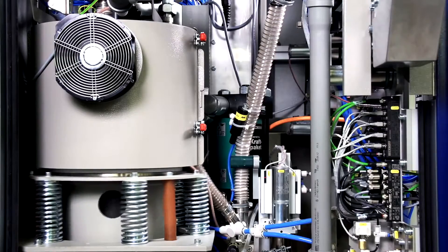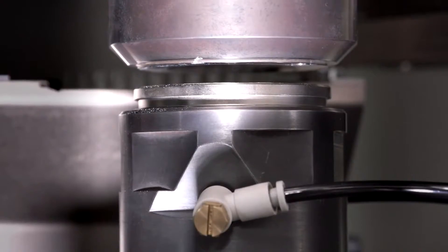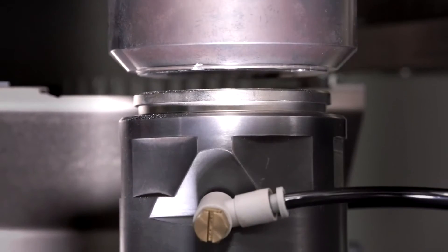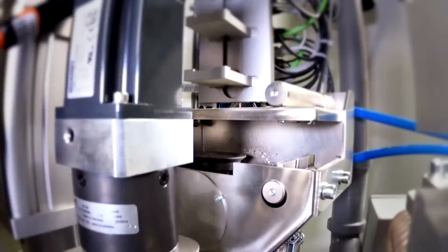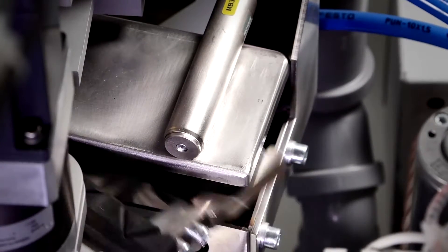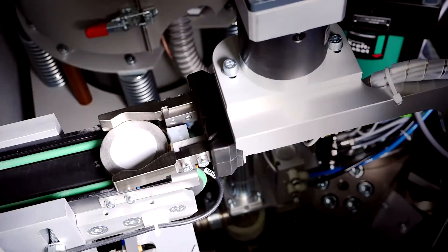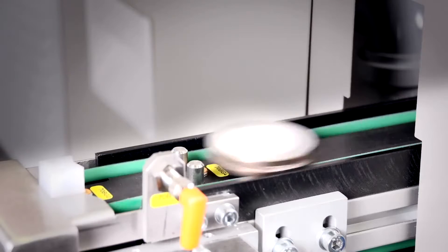The addition of multiple grinding aids can be programmed at various milling steps. The hydropneumatic press will then press the sample. Samples are cleaned and checked for integrity using a vacuum to prevent low-quality pellets from being introduced to the XRF, reducing the risk of breakage during analysis. You can choose between three different cooling options depending on the demands of your application.